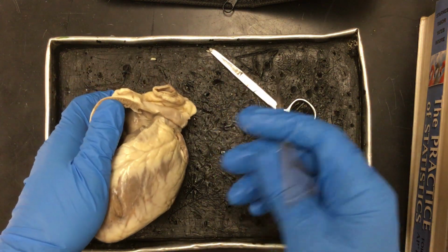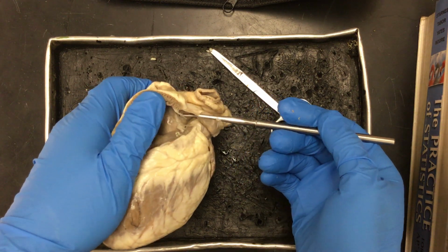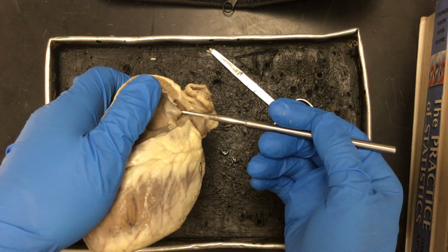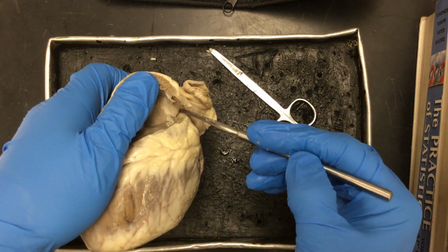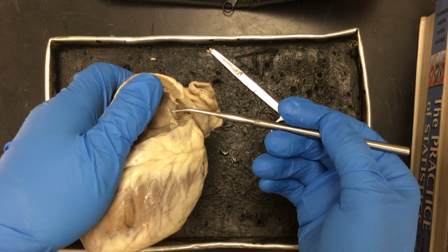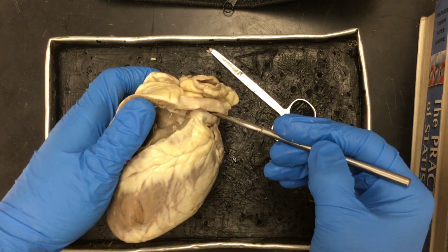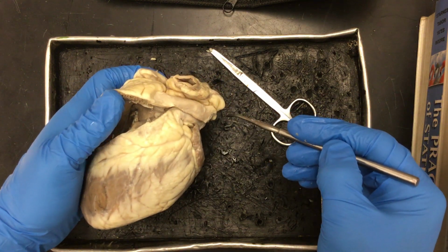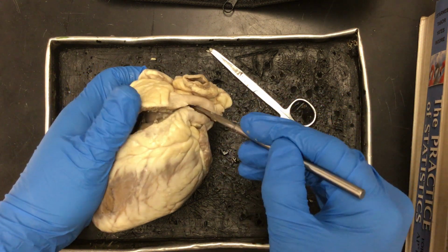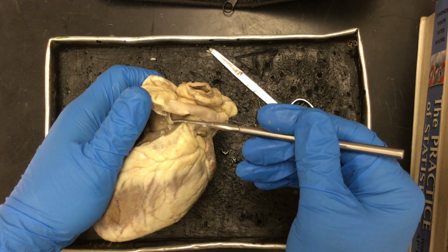You'll notice these flaps right here that I just cut through. This flap prevents blood from flowing backwards, but it allows blood to flow across it. So this is a valve. It prevents backflow of blood. Blood is allowed to flow out of the right ventricle, out the pulmonary artery, to the lungs. But it's not allowed to flow back this direction from the lungs to the heart. It gets stopped by that.